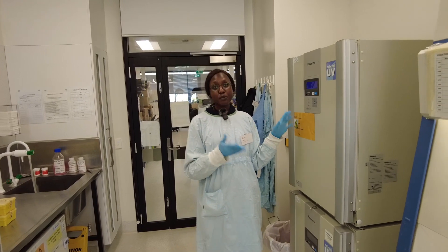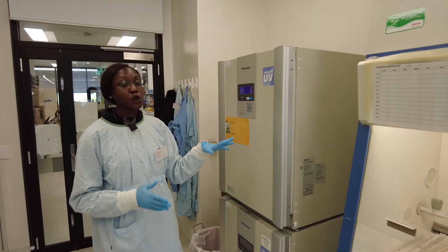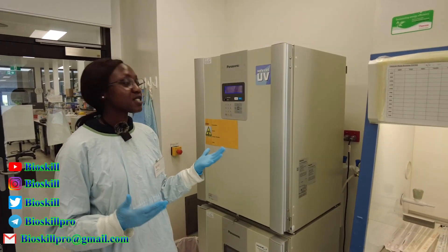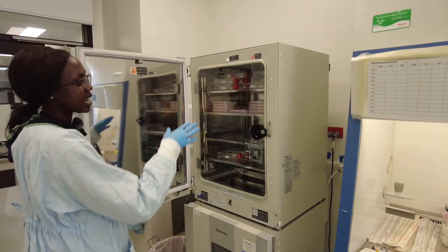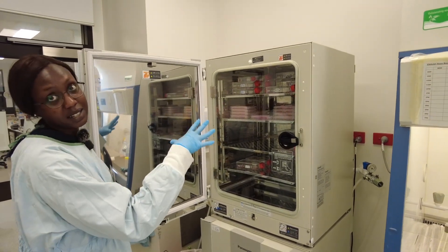The first instrument that we have is the incubator. The incubator is normally at 37 degrees, which is about the temperature of the human body, and it also has 5% CO2 or carbon dioxide levels. This is to keep the cells alive. As you can see, we have different flasks and plates of different cells, and this environment keeps the cells alive.